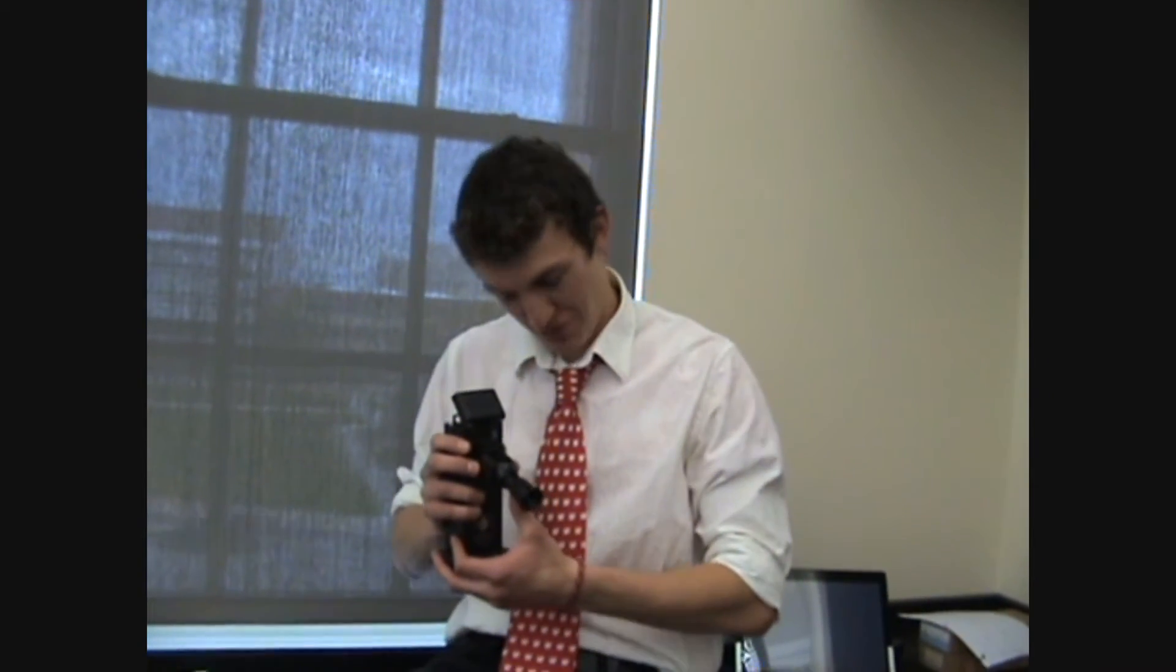but I'm not so good at math. I'm good at biochemistry. So, this one specifically was made in Frankfurt, Germany.